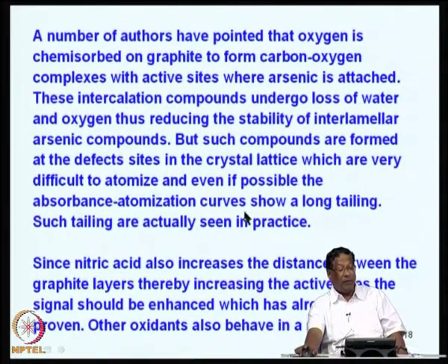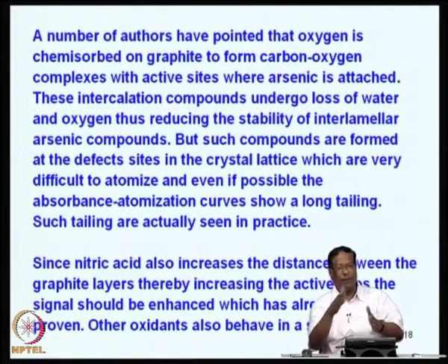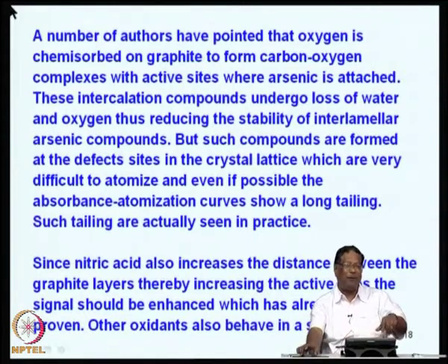So, even if it is possible to determine the atomization absorption curves, they show a long tailing. This tailing we have observed especially in phosphorus. It is not sharp, you do not get a sharp cutoff when you are doing the pretreatment with respect to such compounds. So, such tailings are actually seen in practice.